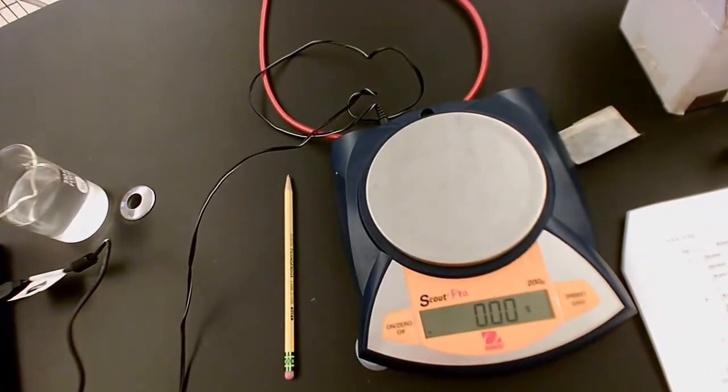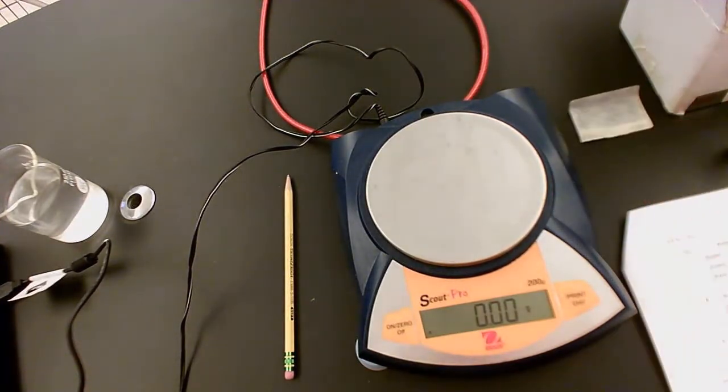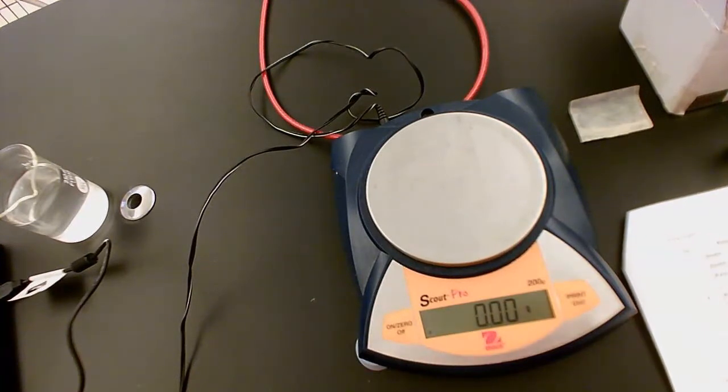Okay, we are going to continue with part C of the density lab. You will be broken up into groups. I will tell you at the beginning of class what unknown letter you are, so you will know which part to pay attention to. For part C, the first unknown I'm going to do is A. So this is sample A.